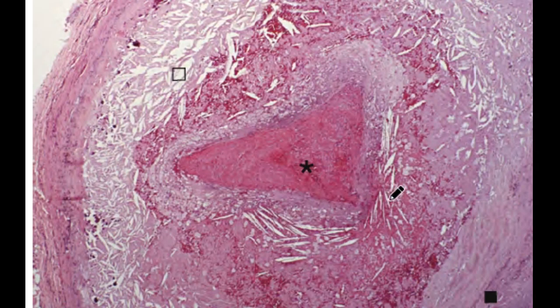So this is a picture of atherosclerosis. This is the artery again. These are the many cholesterol clefts which you can see in the atherosclerosis. And what is this? This is the blood vessel lumen, but here it is filled with thrombus. This is the arterial media which is seen. These are cholesterol clefts which you can see. So this is also a picture of atherosclerosis.